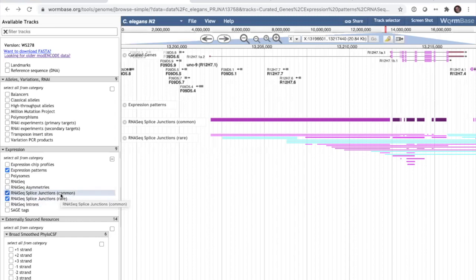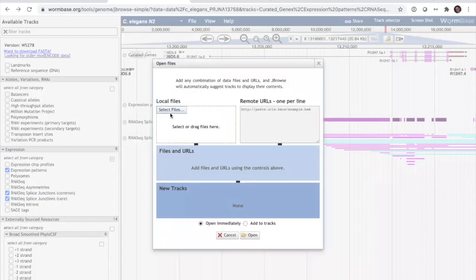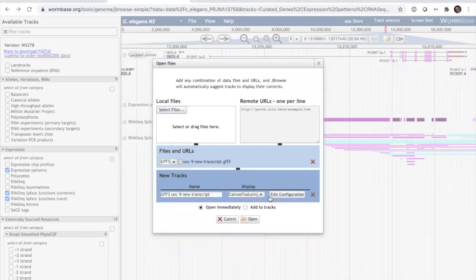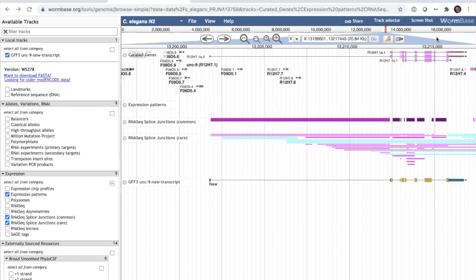Now let's cover loading your own data. Under File, there's 'Open Track File or URL' to load either URLs or local files. I created a modified GFF for UNC9 by editing out one intron — loading it creates a new track very quickly since GFF files are small. You can see the deleted intron is now absent from the custom transcript compared to the reference annotation.